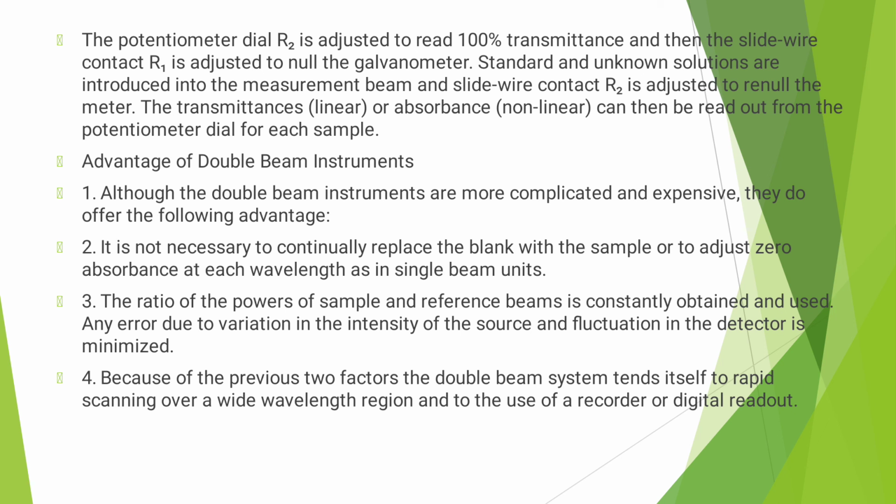Here automatically, once the transmittance is set equal to 100, there is no need to further adjust the transmittance to 100%.